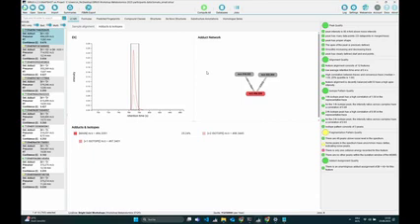Yeah, please. So, if we are working with human serum plasma, and if we know there is a person having some kind of infection from bacteria and fungi, can we be able to detect those kinds of infection, or the bacterial metabolite or the fungal metabolite, in that?